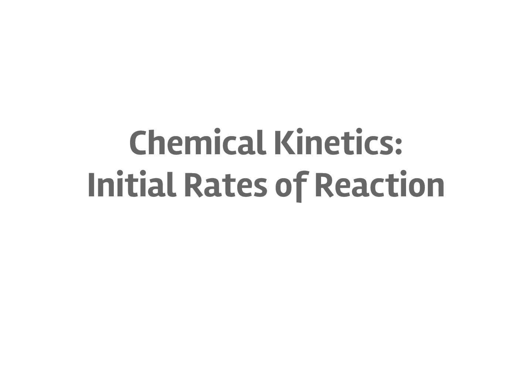Hello! In this week's experiment, we are going to talk about chemical kinetics, initial rates of reaction. And we will talk about what is chemical kinetics, what factors influence reaction rate, how do we even define the term reaction rate, and then we will go into the specifics of our experiment.